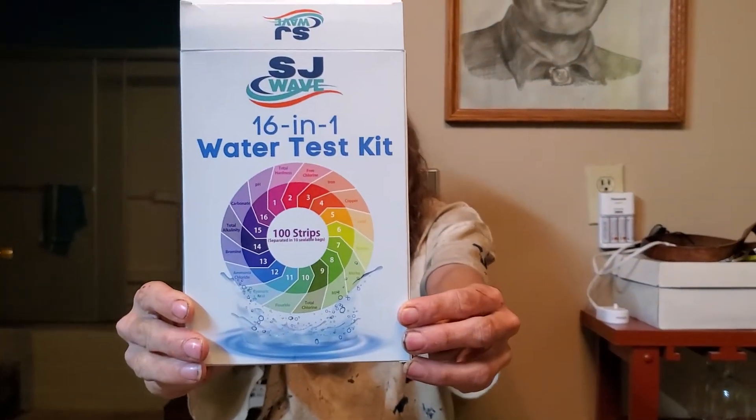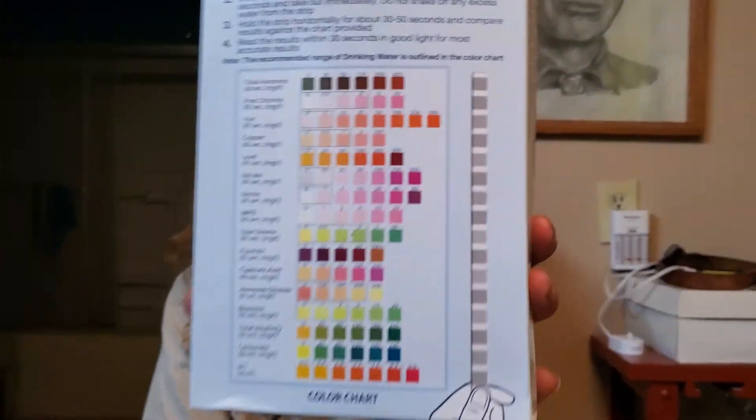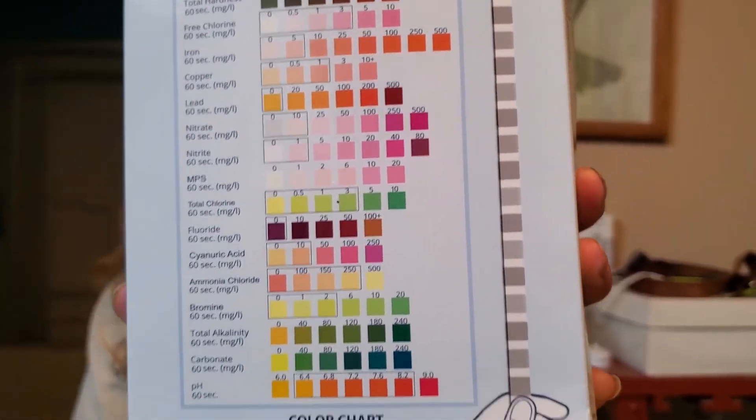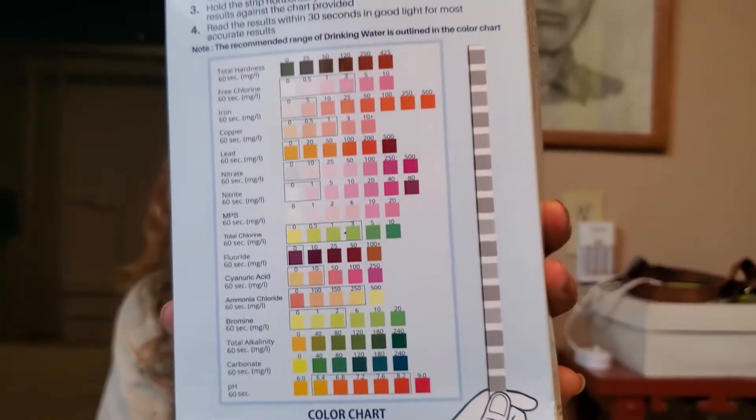Here we have a water test kit. It tells you on the back what it tests for: hardness, free chlorine, iron, copper, lead, nitrate, nitrite, MPS, total chlorine, fluoride, cyanuric acid, ammonia chloride, bromine, total alkalinity, carbonate. The different little colored squares, some of those squares are very close to one another. It's definitely not a definitive test. It's one of those things where you do it and if something seems a little off you'd want to get it professionally done afterwards.